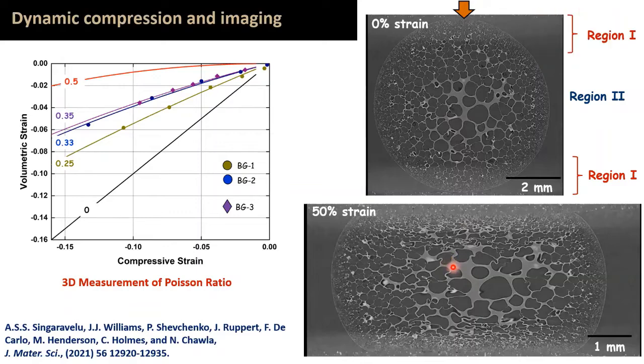Another question. This is under S3, right? Will the S3 kind of damage the structure at all? I mean, this is a polymer. Yeah, that's a great question, and we did some experiments to look at that. In many of the beads, we expose them to the X-rays, and then we take the beads out and we do some hysteretic stress strain measurements, and in most cases they retain their elasticity and their stress strain behavior.